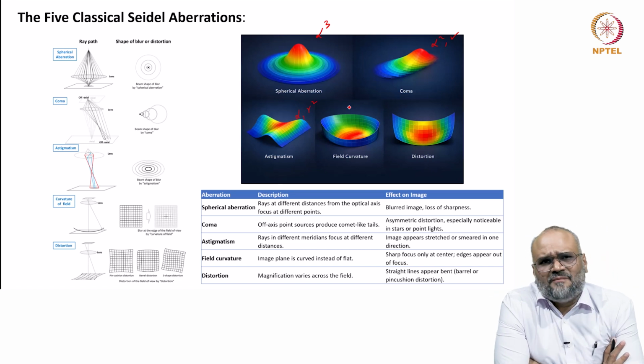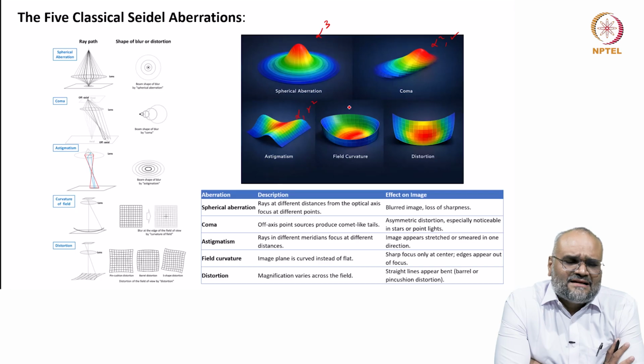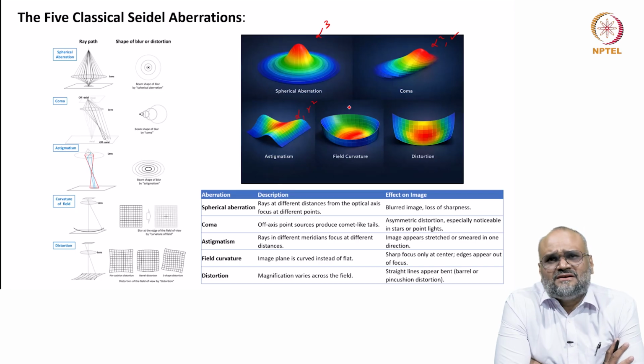In classical optics, you have very good experience in correcting the curvatures or using combinations of lenses, and the rectification of optical lens aberrations is done as a standard procedure.